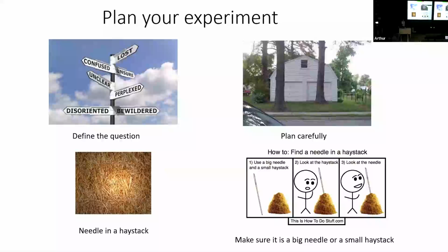We prefer not to look for a needle in a haystack. If you're transfecting cells, for example, we don't want to look at a transfection rate of 10% in your culture medium. It's going to be very difficult to find those cells once we've pelleted and sectioned them. If you look in a section and you have 100 sections of cells, only one of them would be transfected out of 100. That's not very good sampling, right?